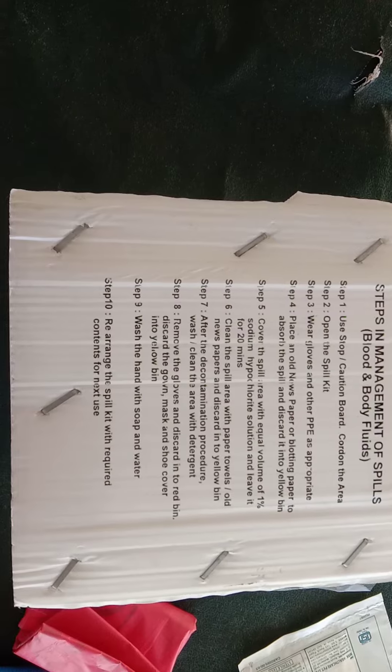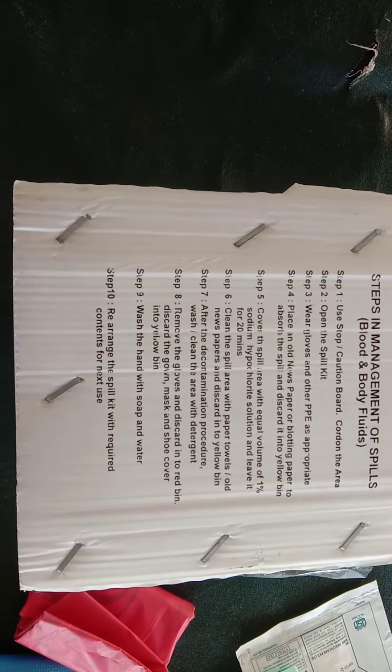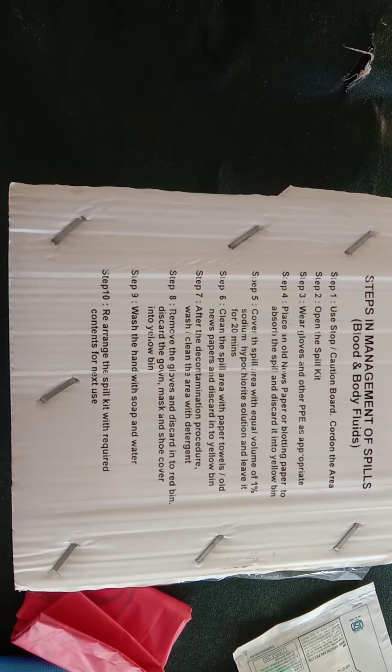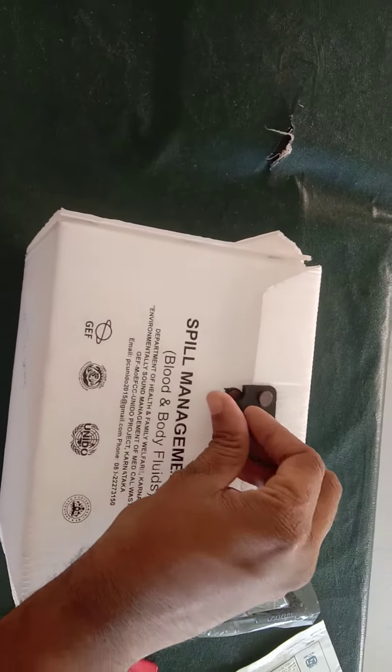Remove the gloves and discard them in the red bin. Discard the gown, mask, and shoe cover in the yellow bin. Wash hands with soap and water. Finally, rearrange the spill kit with the required contents.